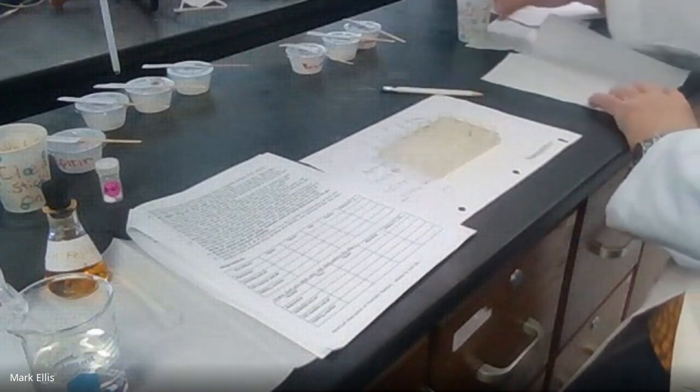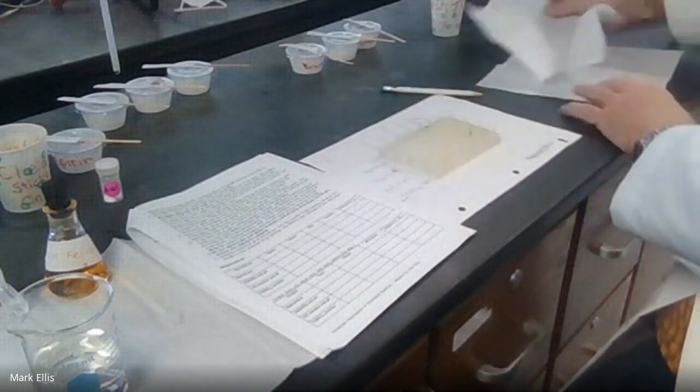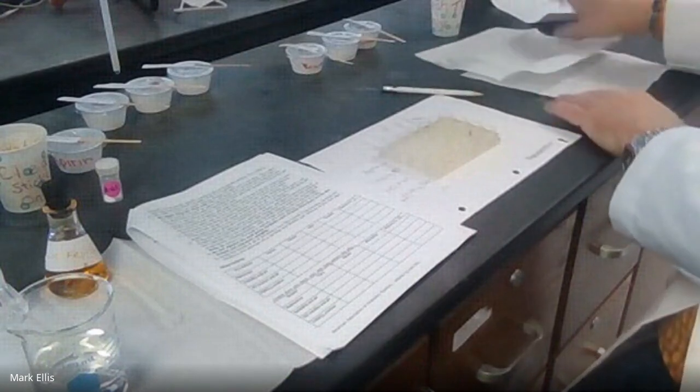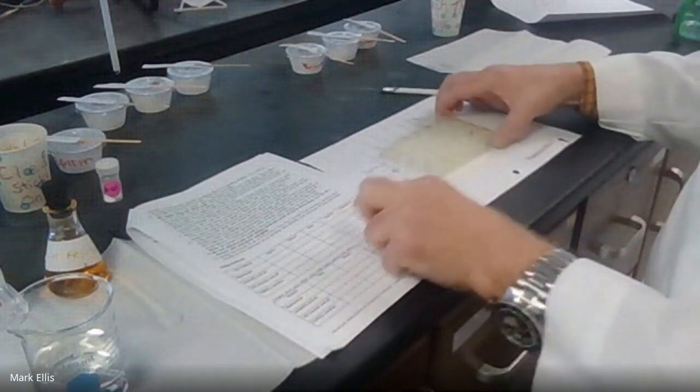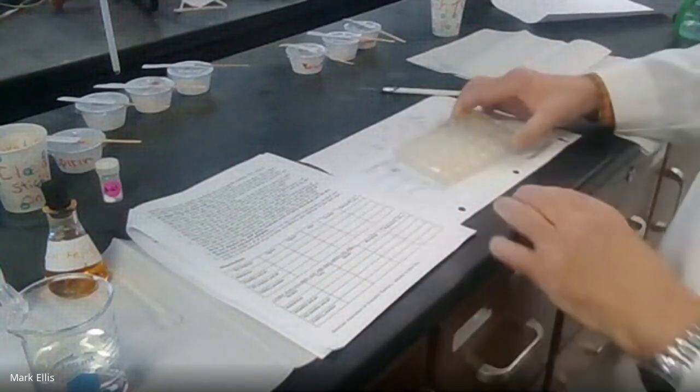I also have a couple paper towels for emergency spills, or the used pH paper. It's good for this. Okay. Now, so the first row, you see that it says just appearance. I'm going to use that just to look at all the appearance, and they're all white granules.